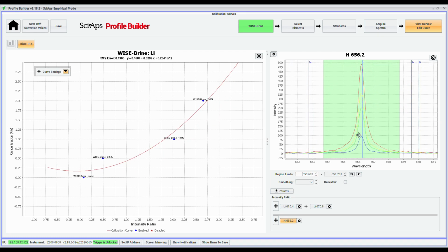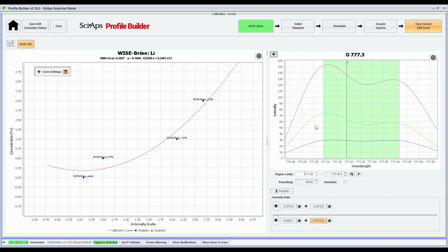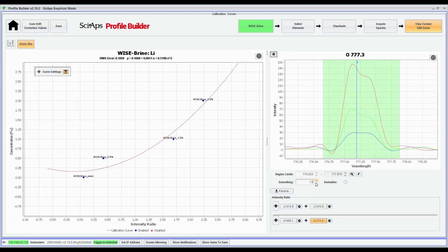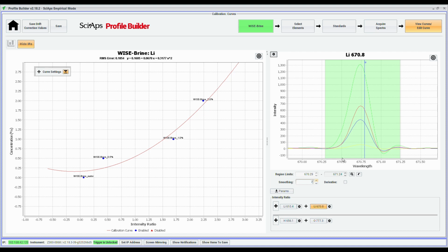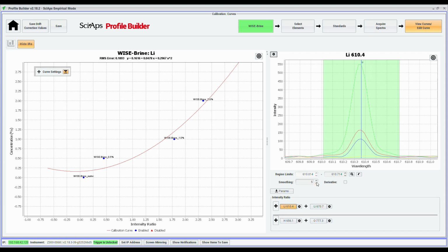So now I'm adding hydrogen. I'm also going to add oxygen to the denominator of this intensity ratio. So we're ratioing the lithium signal to the base material, the sample matrix, and in the case of a geothermal brine or lithium brine, it's mostly water, H2O, so I'm using hydrogen and oxygen, but we will also include sodium. So I'll be adding sodium in here in just a moment.